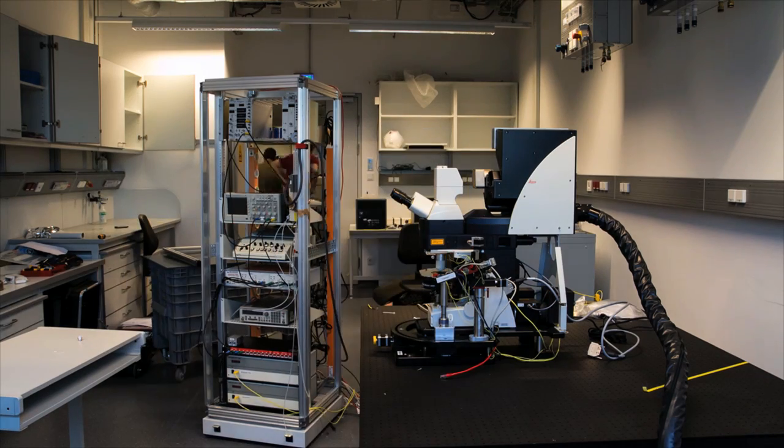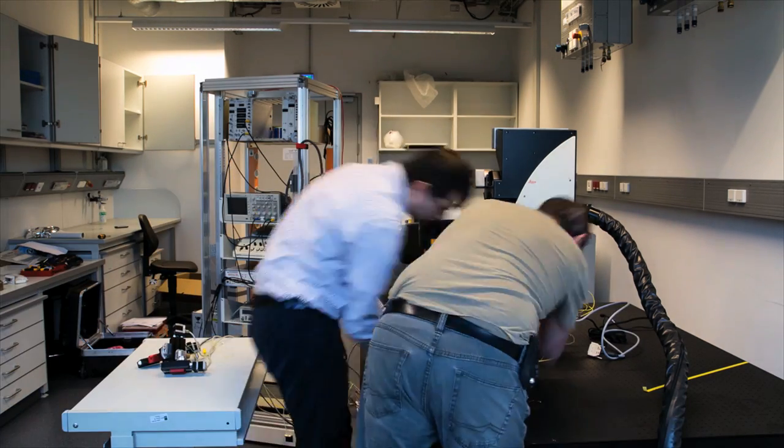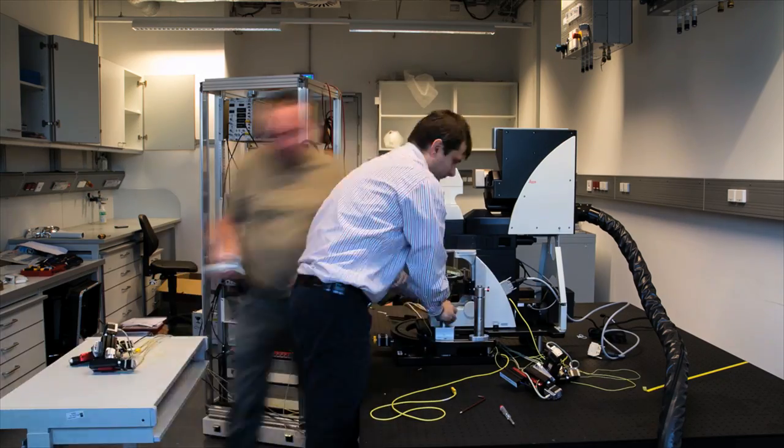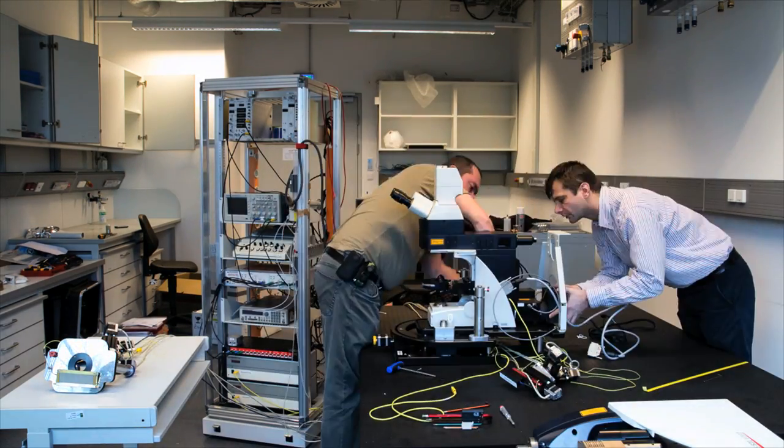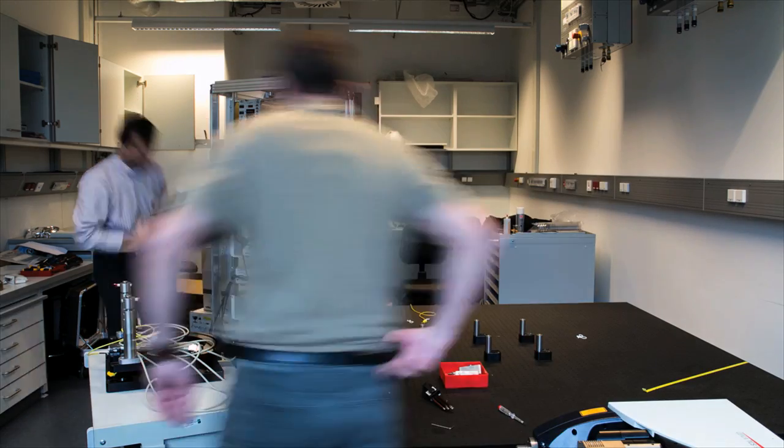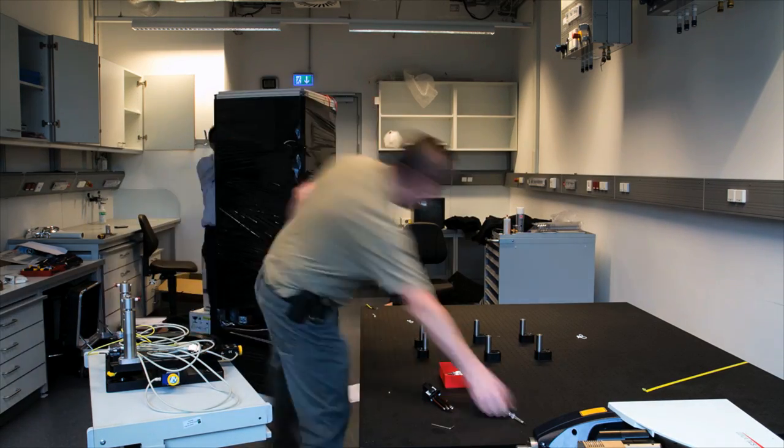Here we are performing combined electrophysiology and imaging analysis to serve the final goal of neuroscience at IST, which is examining the different levels of brain function: the molecular and cellular level, the systems neurobiology level, and finally also the behavioral level.